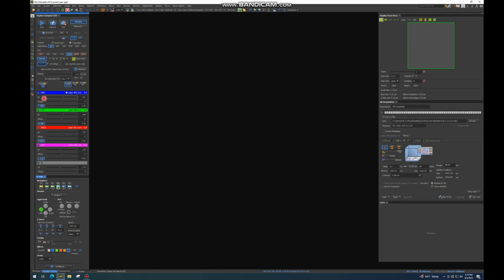So once you've established the gain, you can then move on to laser power and adjust accordingly. If you're putting up your gain super high, I'd actually recommend to put up the laser power slightly, but it's just striking a balance between laser power and gain to optimize the visualization of your sample to where it's accurate to what you should see.